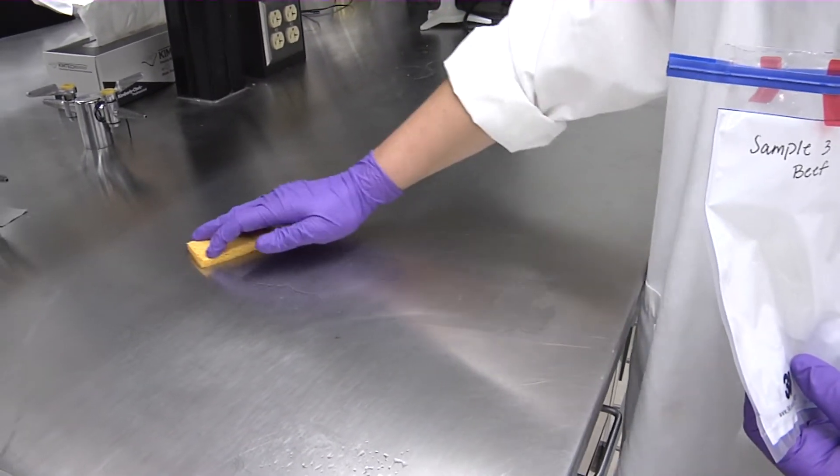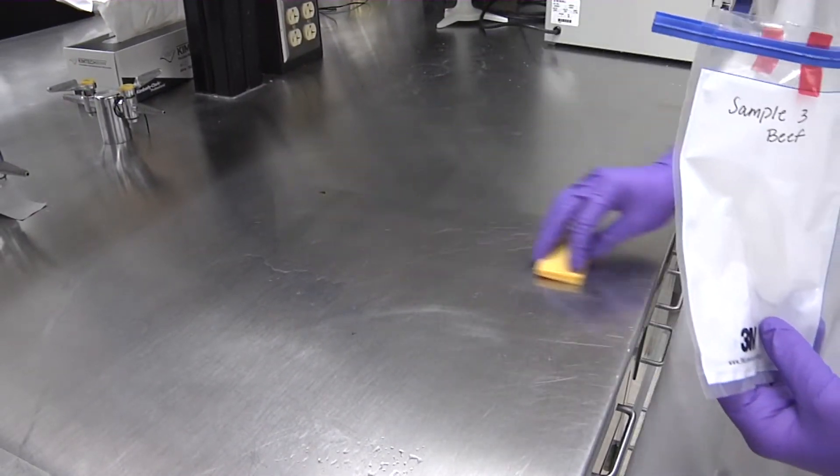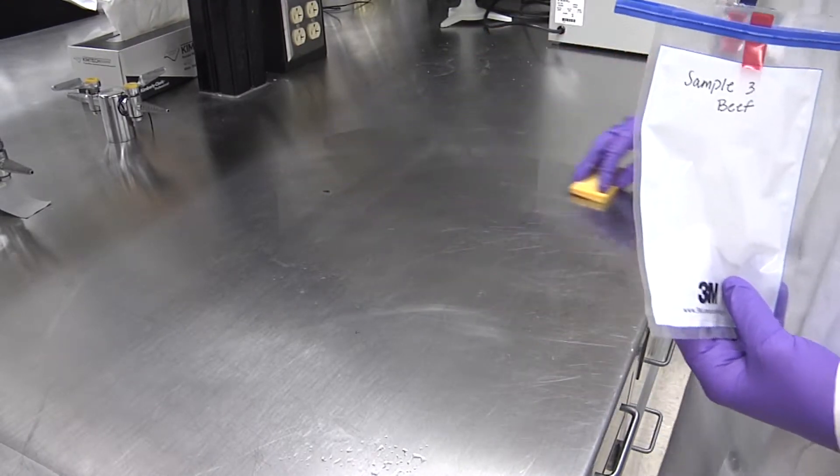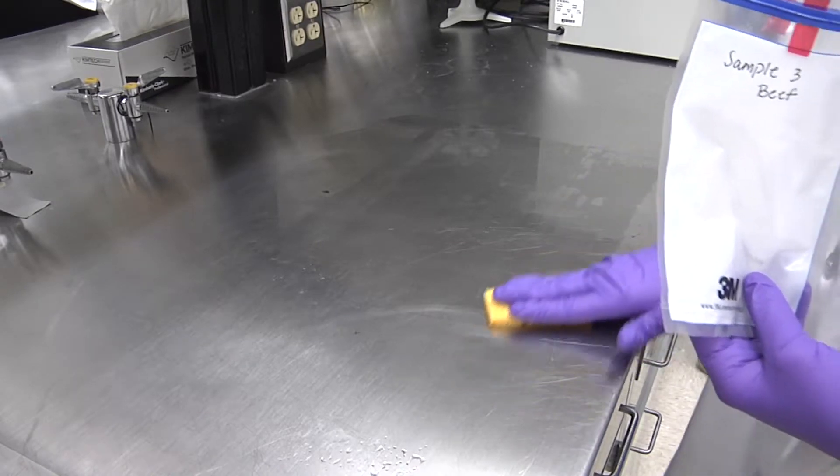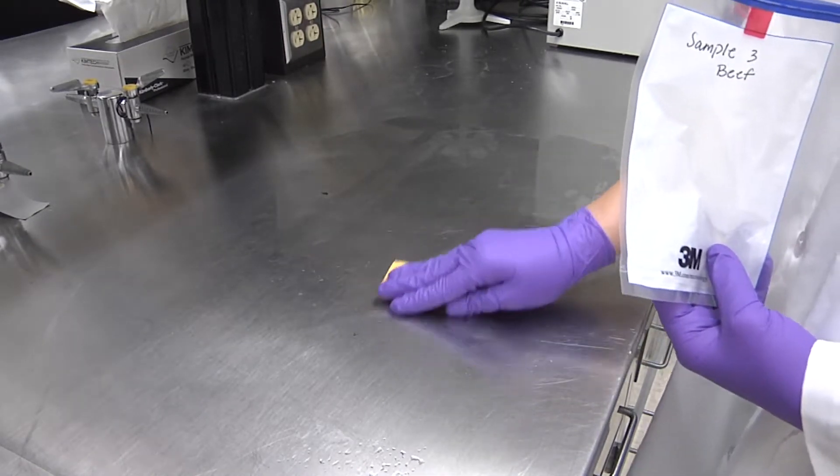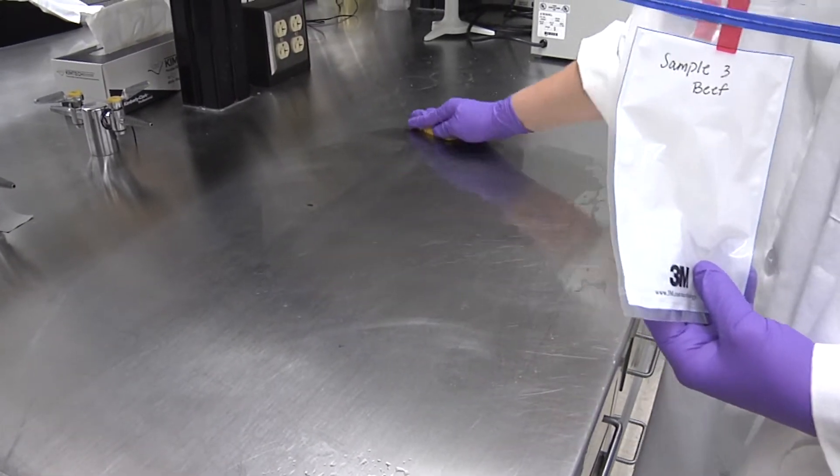Wipe the sponge on the area to be tested, covering a broad area. Some use a standardized area of one foot by one foot. Turn the sponge over and re-wipe the same area, but rubbing in the opposite direction.